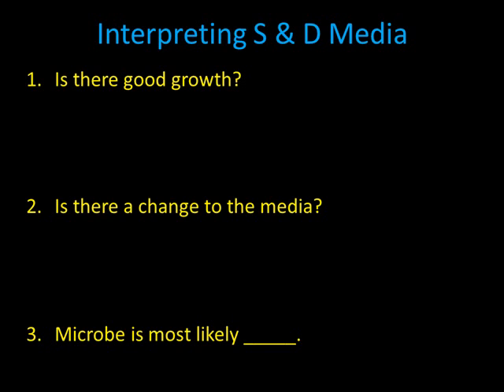Not all steps are used for all media. When the media is selective, you will use steps 1 and 3 only. If the media is differential, you will use steps 2 and 3 only. If the media is both selective and differential, you will use all 3 steps.